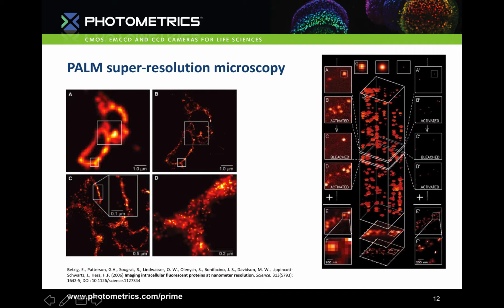The activation laser is then applied again to activate another set of fluorescent proteins, and the method is repeated. So this method of activate, detect, localize, bleach continues until all molecules in the specimen have been localized and none remain to be activated.